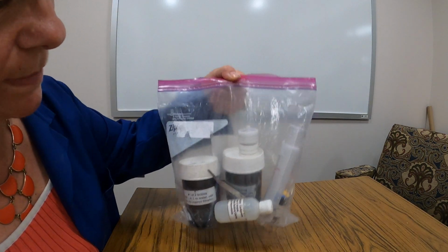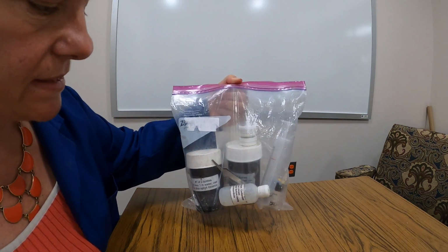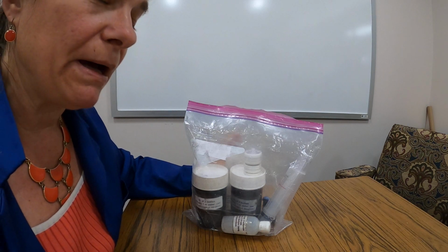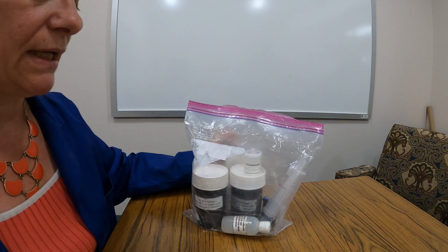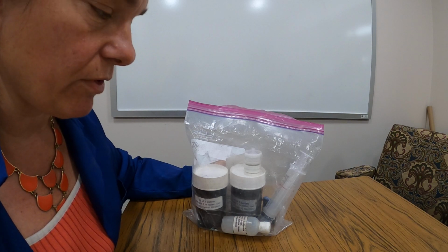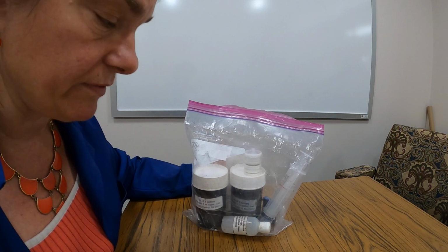So in your monitoring supplies, you will have a kit that looks something like this. This is our chlorophyll kit. And on about an every 2-week basis, you will collect samples and filter them so that we can analyze them later on for algae or chlorophyll level.